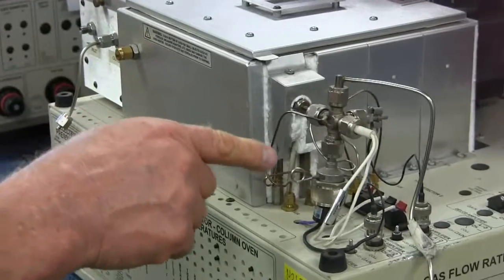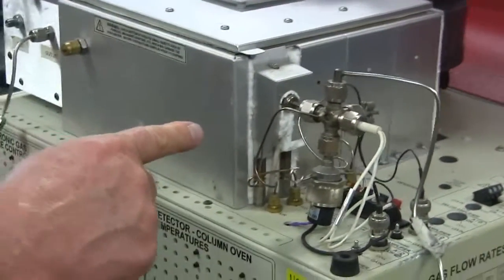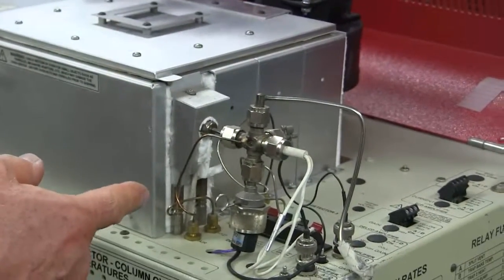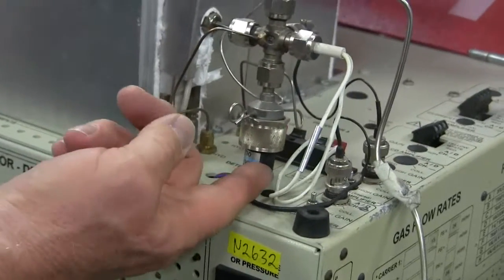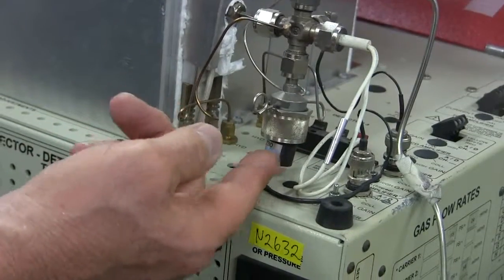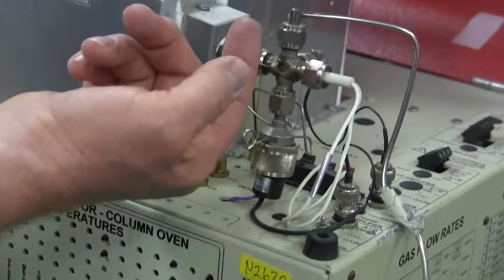This GC here is equipped with a flame photometric detector, typically used for detecting sulfur molecules. You can tell the FPD detector, flame photometric detector, because it has a photomultiplier tube in the bottom which is staring up at the flame.